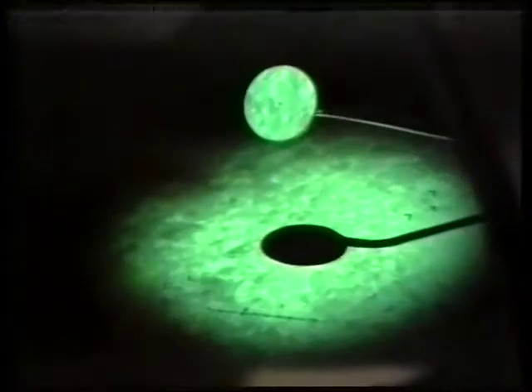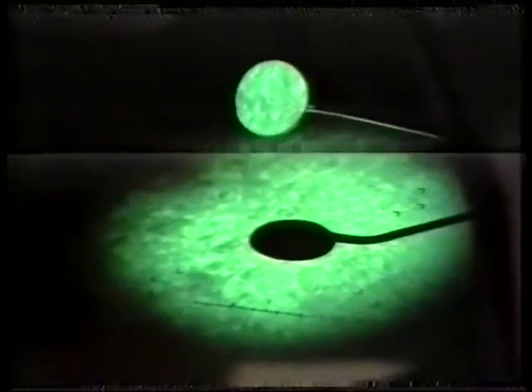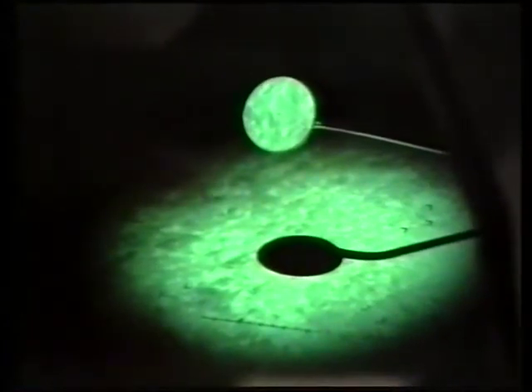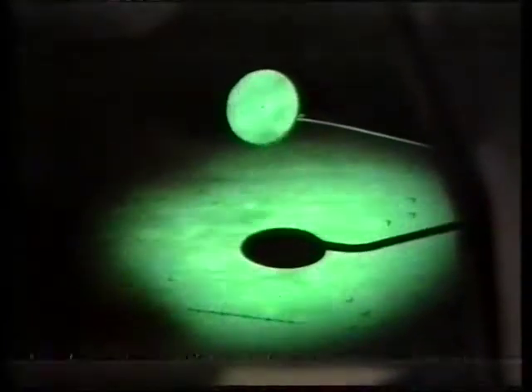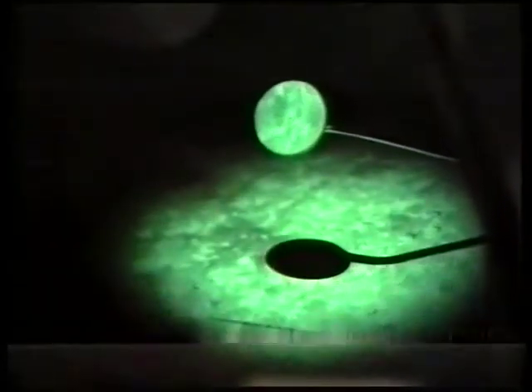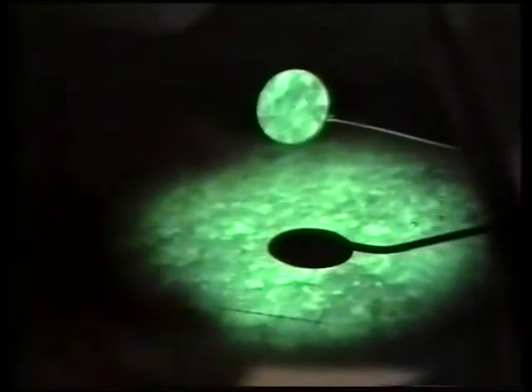We're looking for small white dots, and we've done it enough so we know what size of white dots we're looking for. But otherwise, there are lots of different sizes of white dots, and you have to be able to visually pick out the different ones. There's a certain structure for a virus. It's like an angular structure. So if it's just perfectly round, then it's probably not one of these types of viruses.